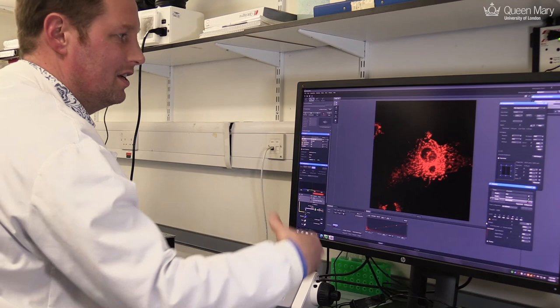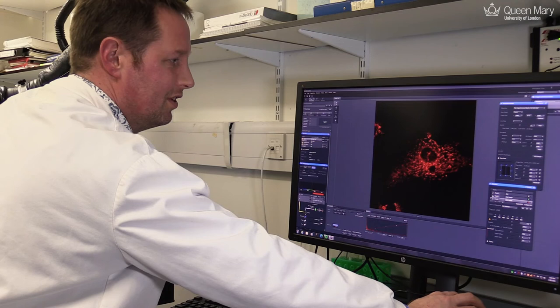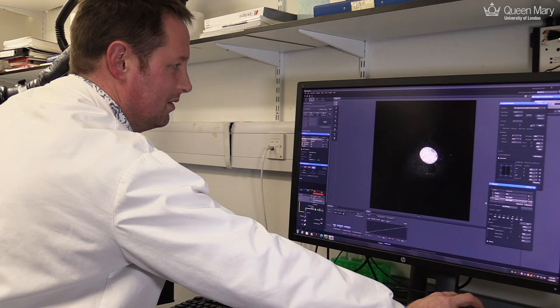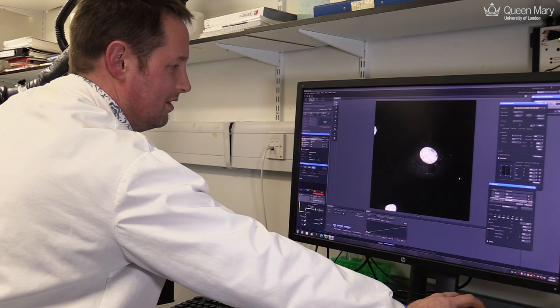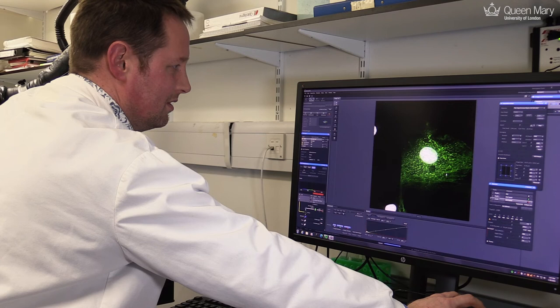So we can then study how these components of the cell interact with one another. The only thing we then have to do is take an image of all three of them. So we have the nucleus, we have the microtubules, and then a third will be the mitochondria, that come through in red.